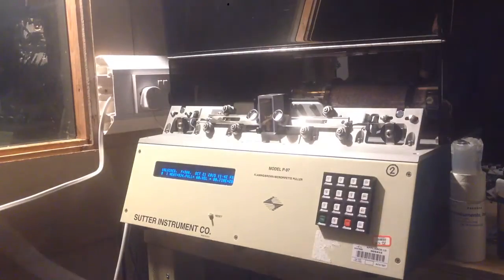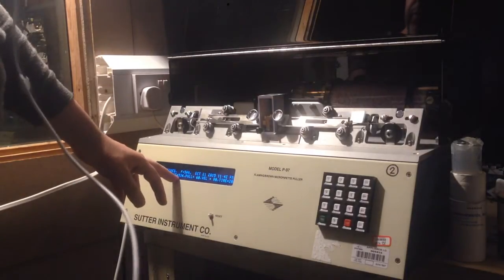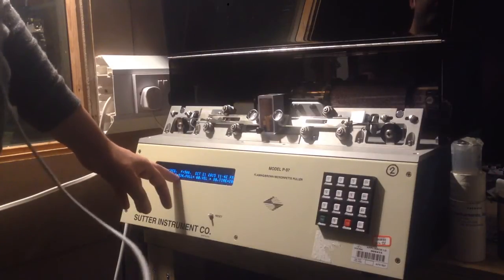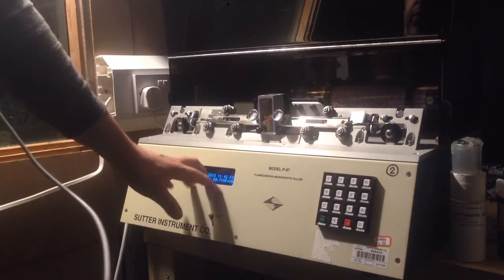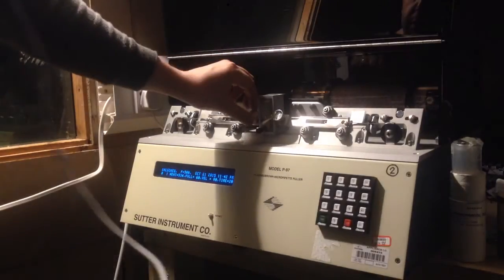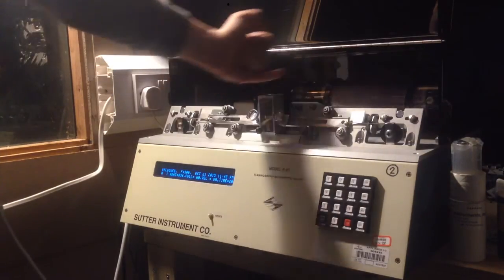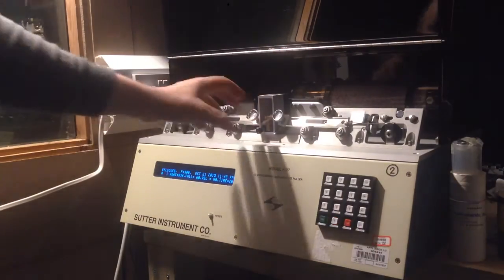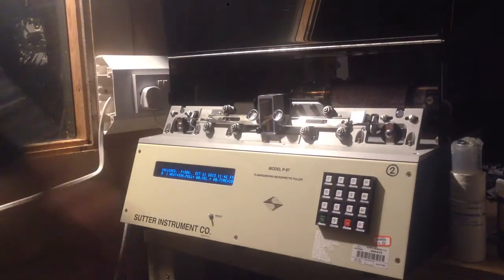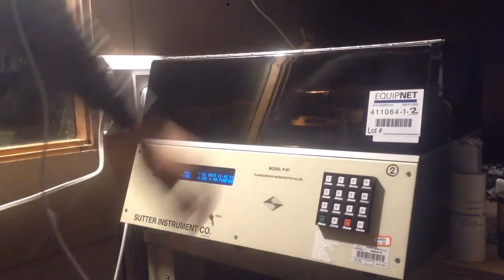Don't tighten too much otherwise you may break the borosilicate — though it's surprisingly flexible; it will bend without breaking. I got a heat value of 519 from the ramp test, so heat is 15 plus that. The other values are the standard ones from the manual. It also mentions a pressure value but there's no option to enter it. So I press the levers down to release the pulleys, push them together, and the glass tubing goes through. You can see there's a little filament already installed in there.